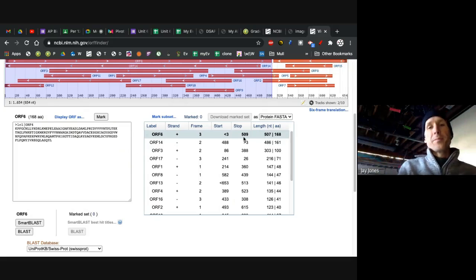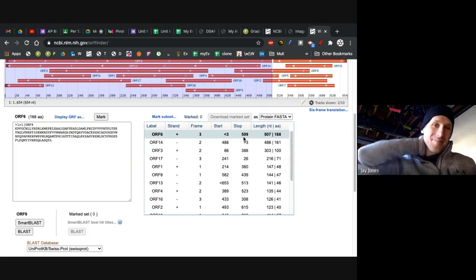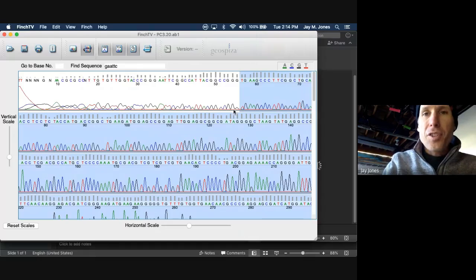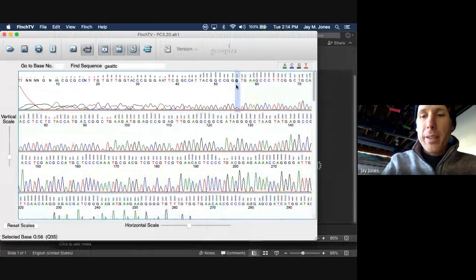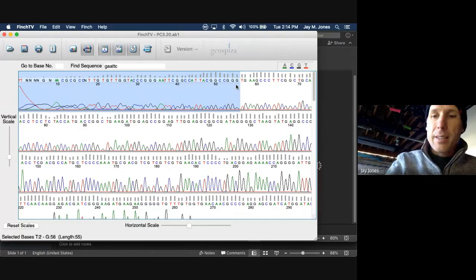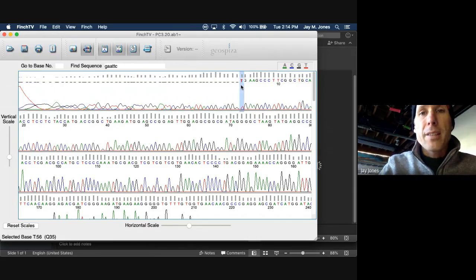Now, one more thing. How do you get the rest of those numbers? Well, you could use Finch if you want. This is kind of optional. You can go to Finch. There's our whole cDNA sequence. But the original numbers are in there. But you can take those out quite easily. I'm highlighting all the code before the inserts start, before that T56. Ready? Delete. Here we go. All gone. So now I start at that T1.